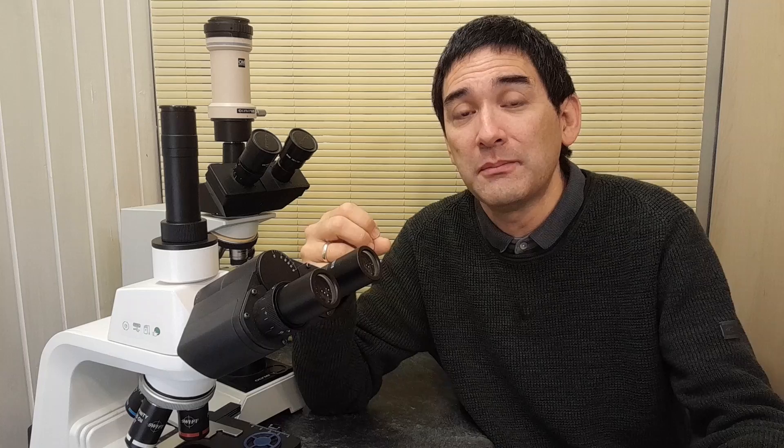And the interesting comment here is is the following. Well, you have to kind of like using the microscope. And if you spent already so much money on the microscope and you're always afraid of breaking it, or of doing something wrong and then it doesn't work anymore and you cannot get it serviced because it's a closed system. Then of course this takes the fun out of microscopy. So my suggestion as always is start low and then upgrade.